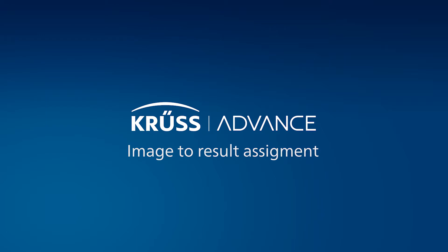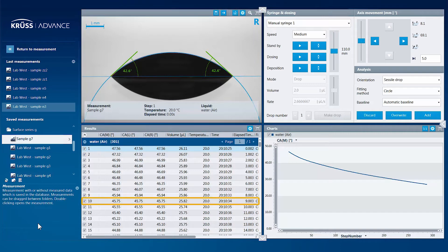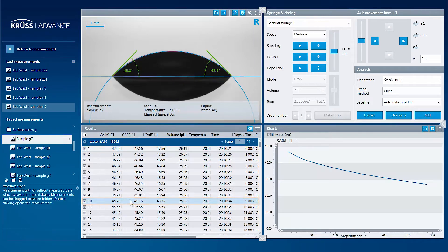Advance assigns each original image to the results which were calculated from it, allowing you to look back at where your data came from. The images which Advance uses to calculate a contact angle can be re-displayed in the Live View Monitor by clicking on a line in the result table or on a data point in the result chart.